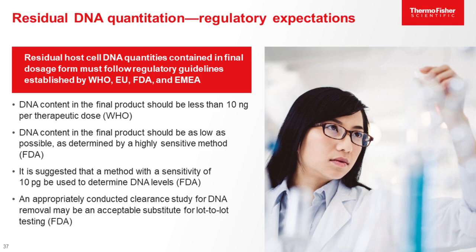Another traditionally important function of downstream purification is the removal of residual host cell and vector DNA impurities. Next, we'll hear from Ilaria again, this time to talk about some simple and reliable analytical kits to measure residual DNA designed to meet regulatory requirements for lot release testing.